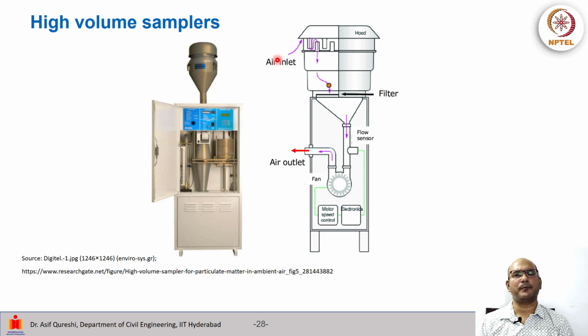So a PM10 sampler will sample PM less than 10 micrometer up to the size of the filter pore. The PM2.5 sampler will allow passing of fractions of 2.5 or lower, 50% of 2.5 and all the lower, up to the size of the filter.